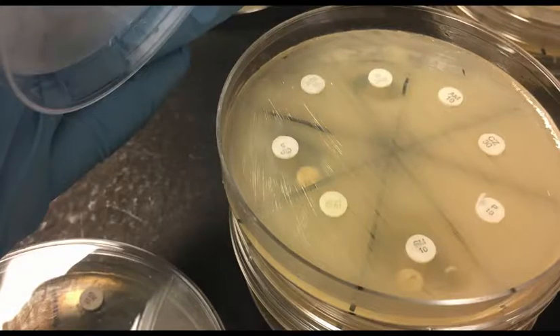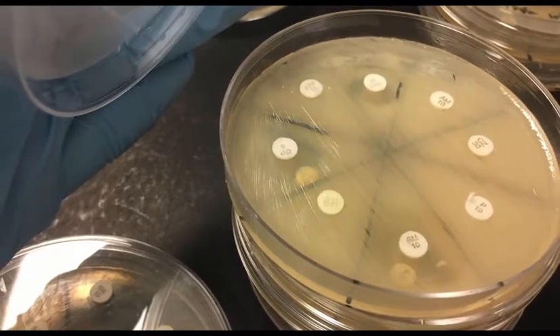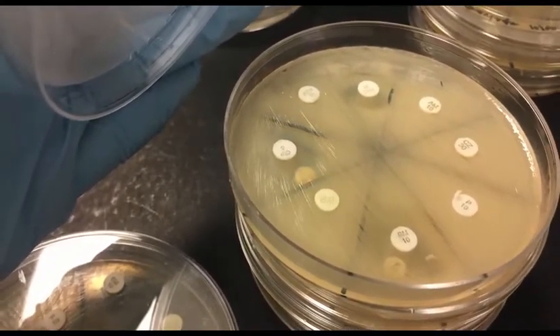From here, we are continuing Kirby-Bauer susceptibility tests and will create a total antibiotic resistance profile of the isolates from each county.